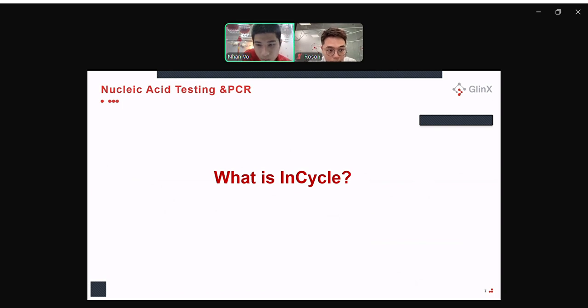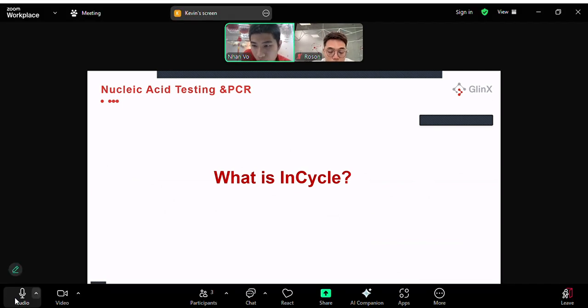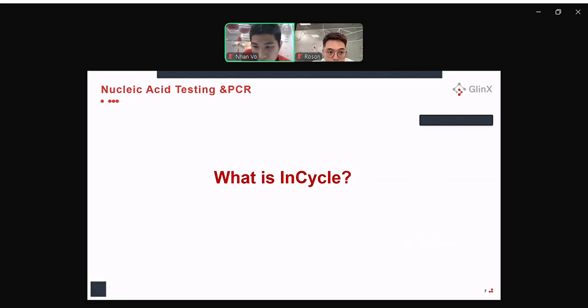And when you go into the clinic to introduce the InCycle machine to the clinical doctors or the vets, you might often give this kind of brief introduction of the InCycle machine. So we can have a review.